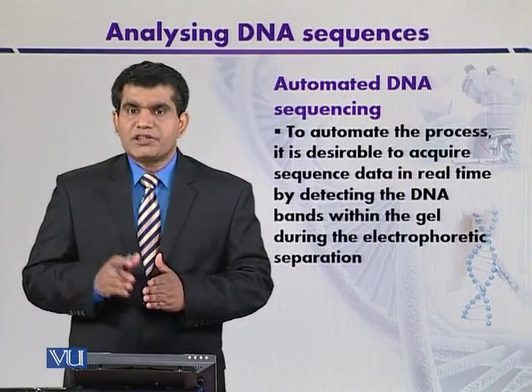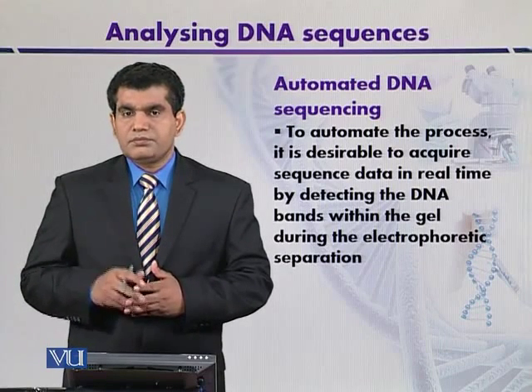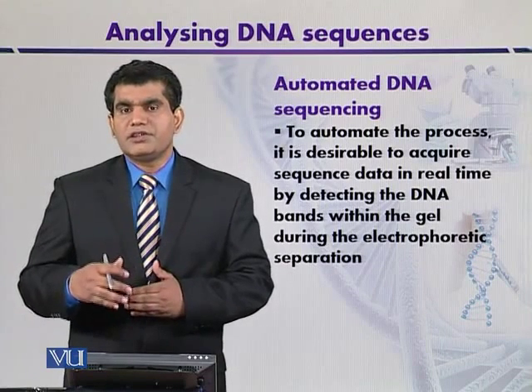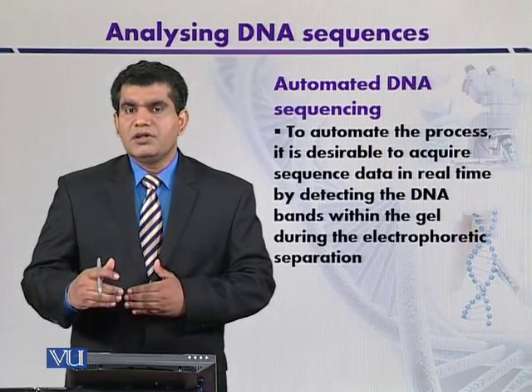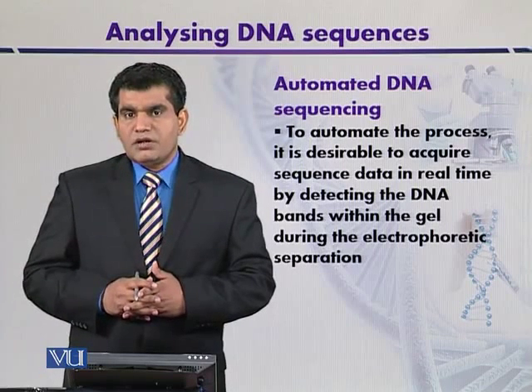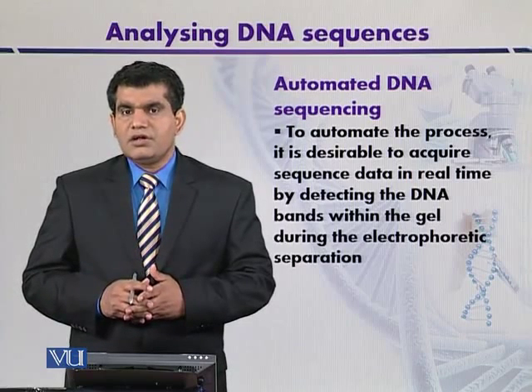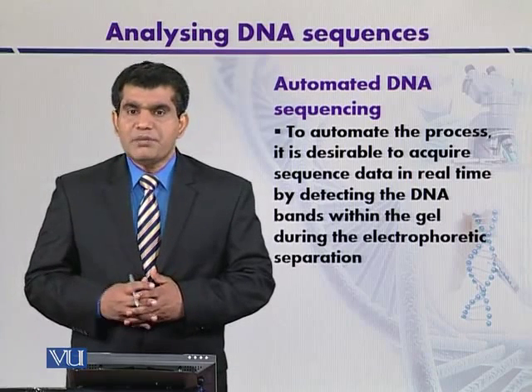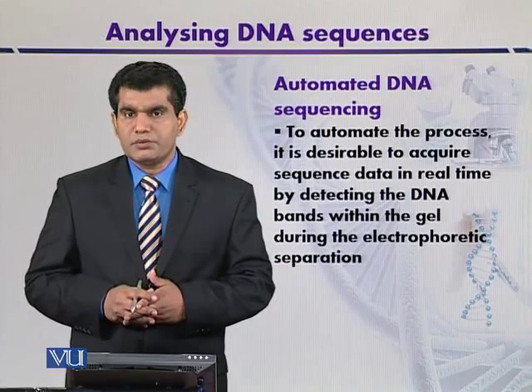So spectrally, the staining reagents that we are going to use will emit different colors that will be detected by using the detector. In addition to fluorophores or the staining dyes, some specific primers that are labeled with dyes can also be used.